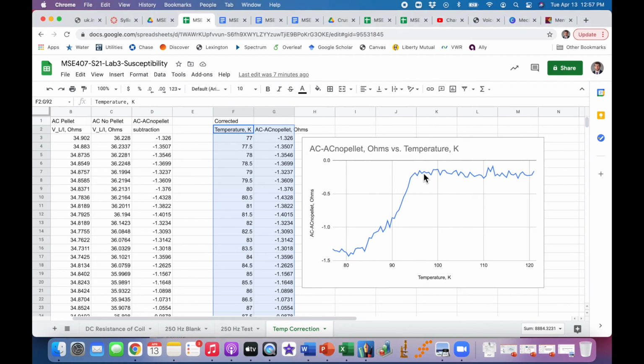So this value, as you can see, you can fit a line to this to get a better estimate, but essentially this is negative 0.2. If we just go through all these values, it's roughly negative 0.2 is what I'm going to take that value as. And so if we're looking for the midpoint, we want to get the midpoint between this and this. And so this down here is about negative 1.4. So the midpoint of this would be about negative 0.8.